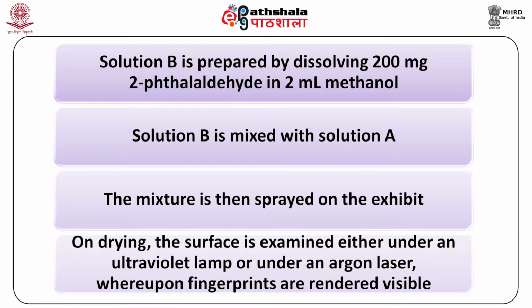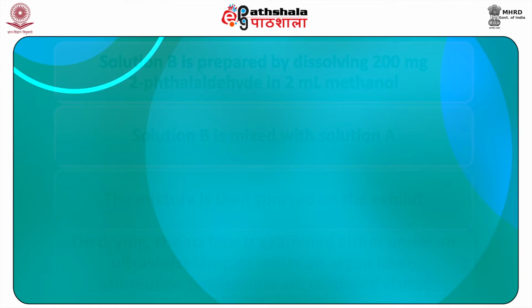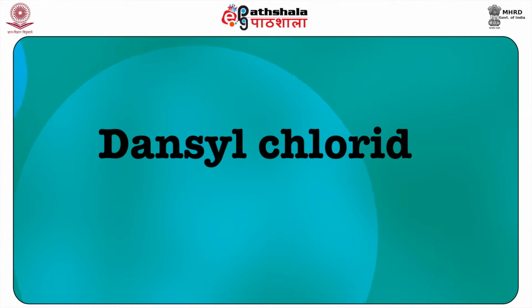Solution B is mixed with solution A. The mixture is then sprayed on the exhibit. On drying, the surface is examined either under an ultraviolet lamp or under an argon laser, whereupon fingerprints are rendered visible. Third is dansyl chloride.